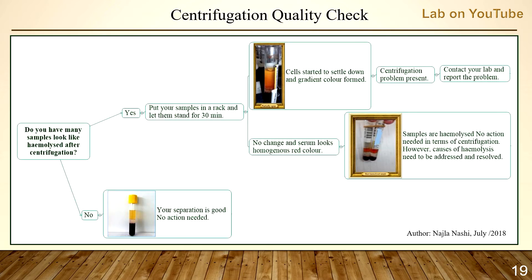To determine if you have a partial spin sample problem, follow this chart. Do many samples look hemolyzed after centrifugation? If no, separation is good — no action needed. If yes, place samples in a rack and let them stand for 30 minutes. If cells start to settle and a gradient color forms, a centrifuge problem is present — contact your lab. If no change and serum looks homogeneously red, samples are hemolyzed; causes of hemolysis need to be addressed.